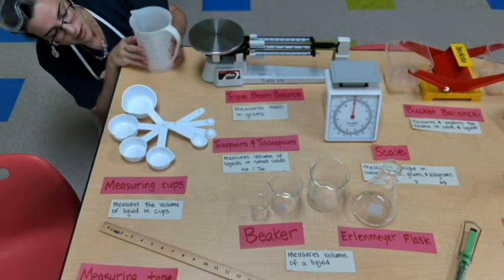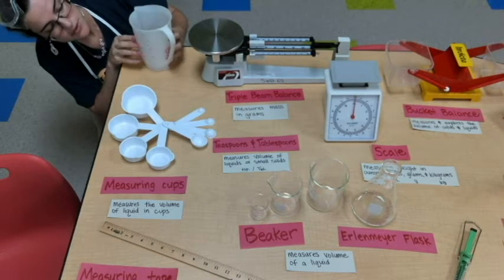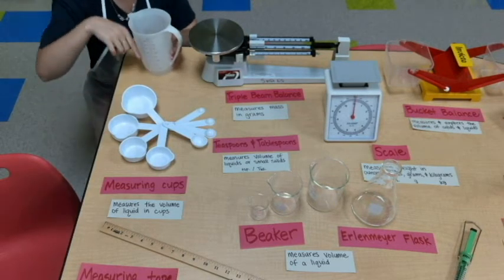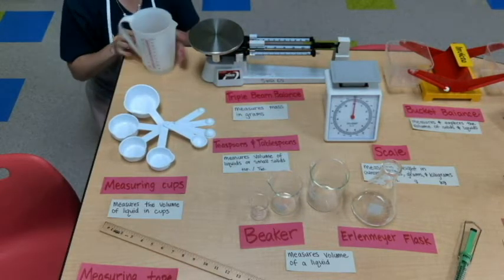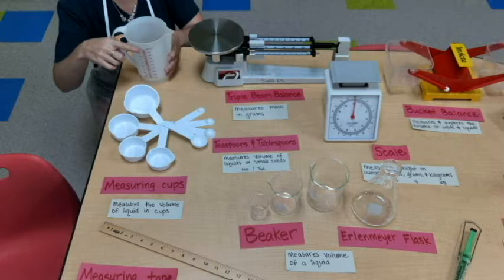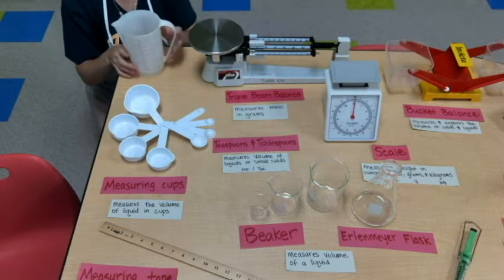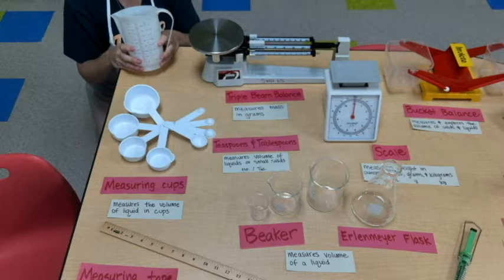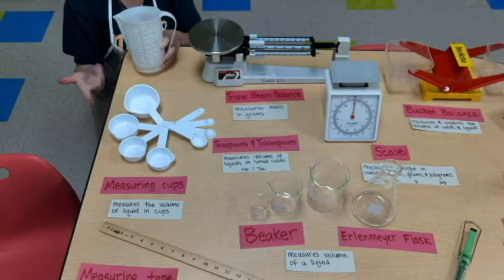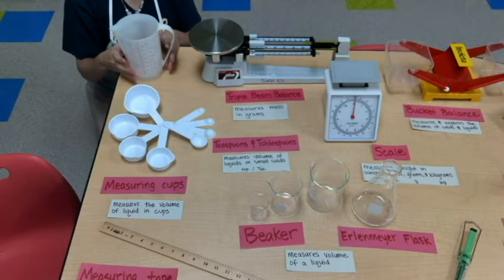This has measurements in cups and ounces. This goes all the way up to four cups, so that would be four of these inside here. You turn it around and then you get measurements in milliliters. So this is a handy tool depending on what you're trying to measure, whether it be cups, fluid ounces, or milliliters.